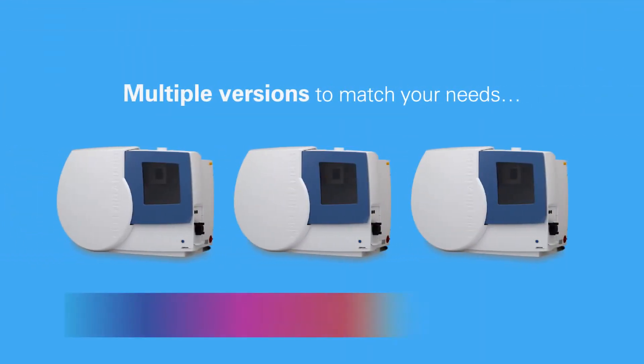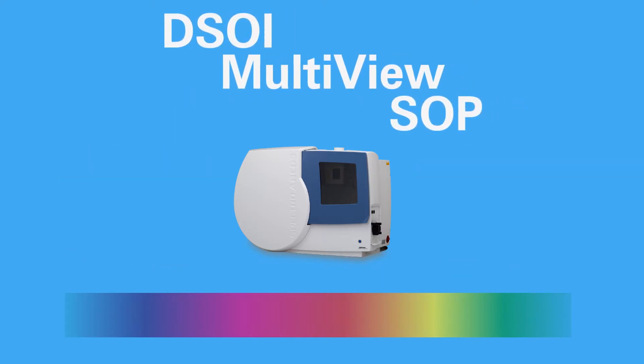Select the right version to match your exact needs for plasma viewing and wavelength range. All feature exciting new technologies.